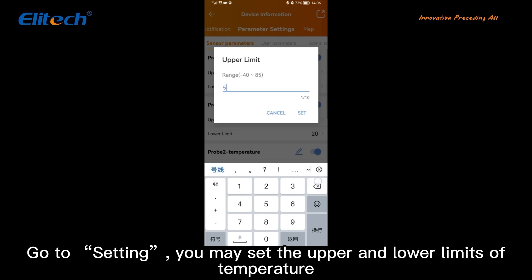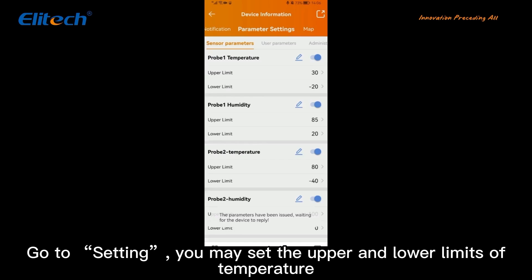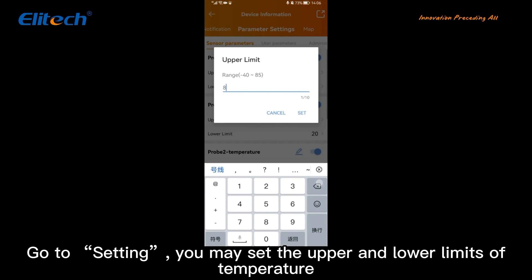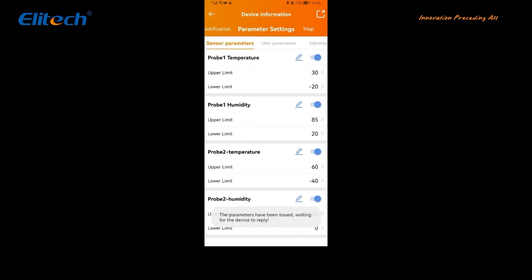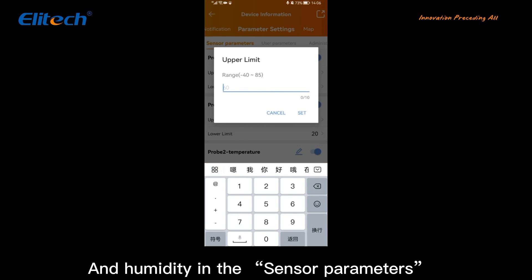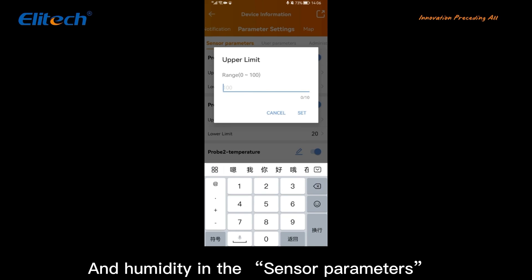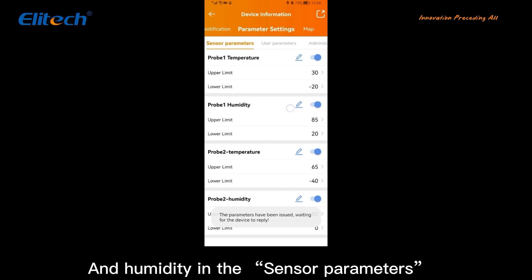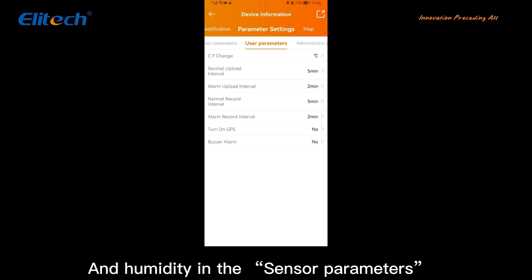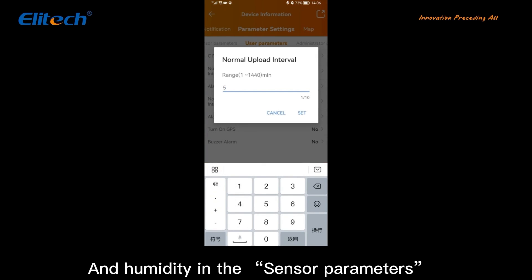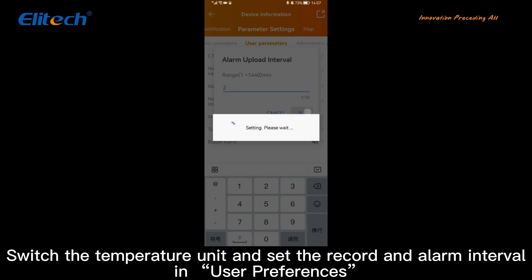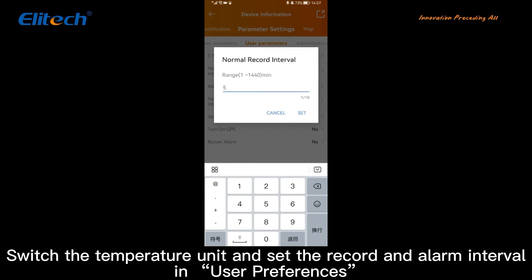Go to Settings where you may set the upper and lower limits of temperature and humidity in the sensor parameters. Switch the temperature unit and set the record and alarm interval in user preferences.